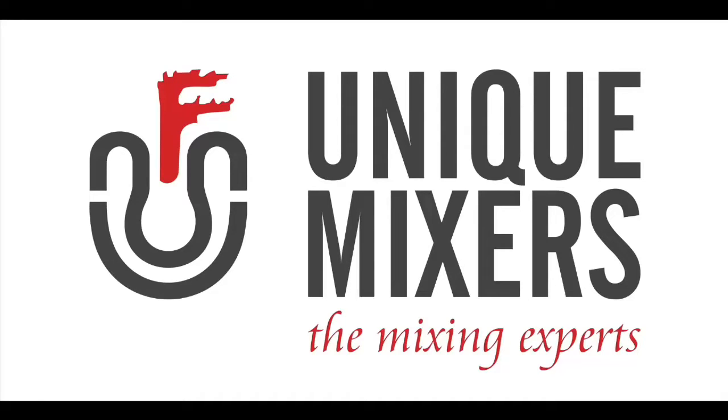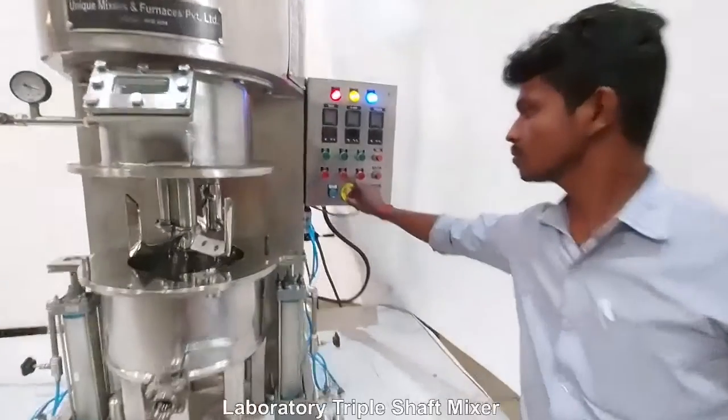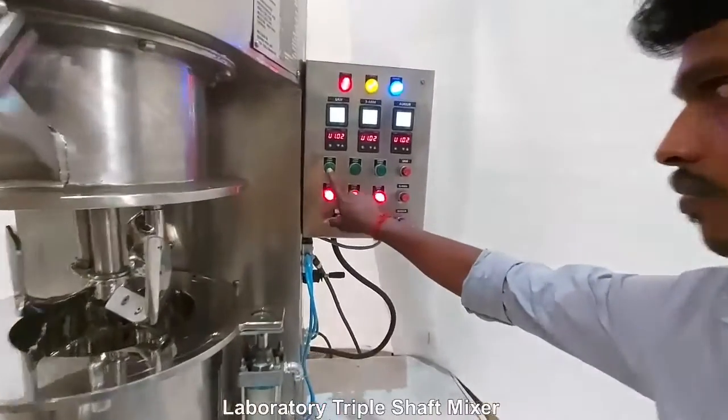Hello all and welcome to Unique Mixers, the mixing experts. Today we present to you our laboratory triple shaft mixer in stainless steel 316 construction.